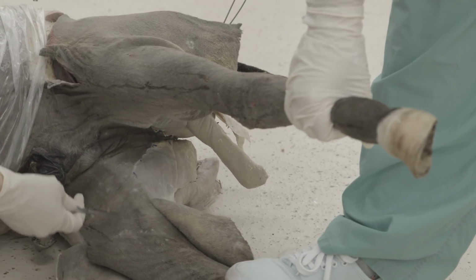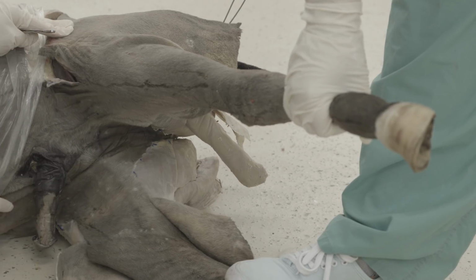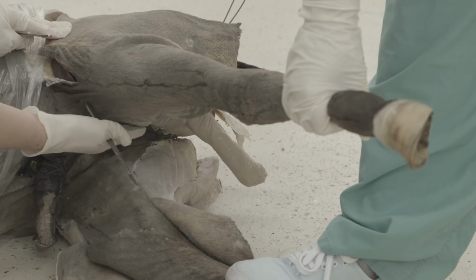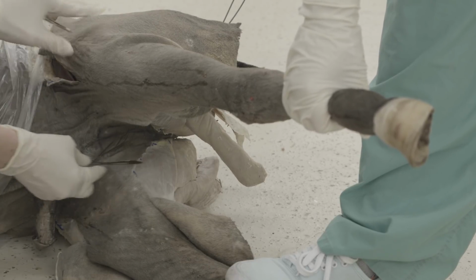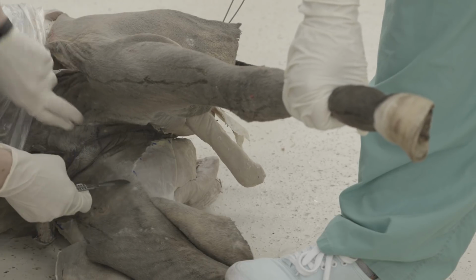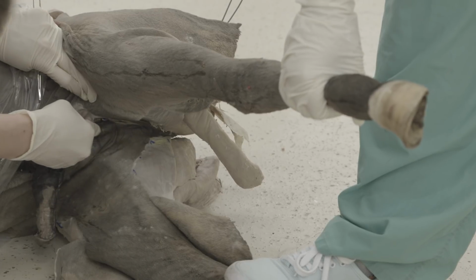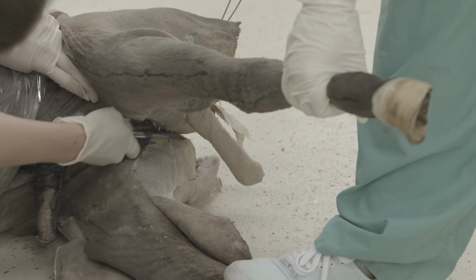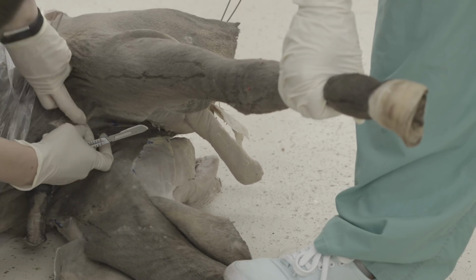It's a little harder to do it by yourself, but you're going to go down by the ventral midline. And in the male, you have to be careful because you need the penis to stay with the right side. So make sure you're not cutting through that. And so you have to move just a little bit off midline towards the left limb. And you're going to start cutting. And you're going to cut through the skin and then all of the muscles underneath there.